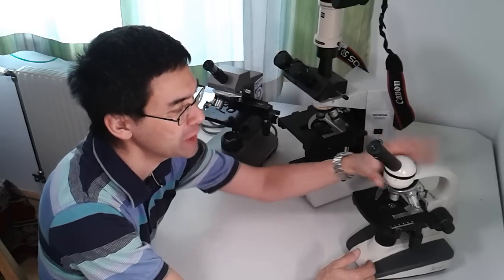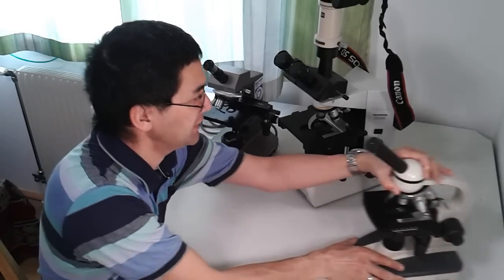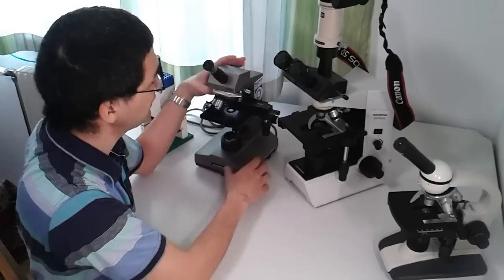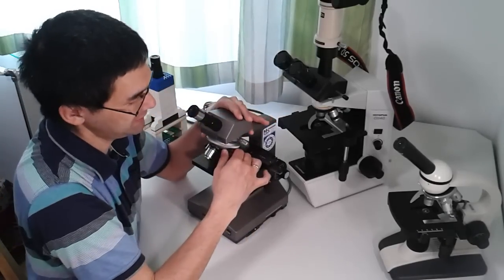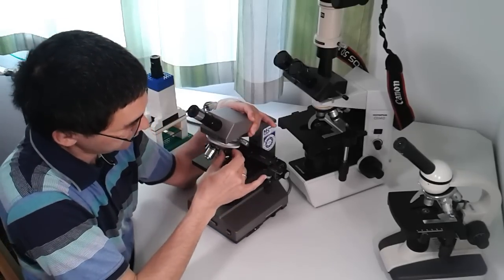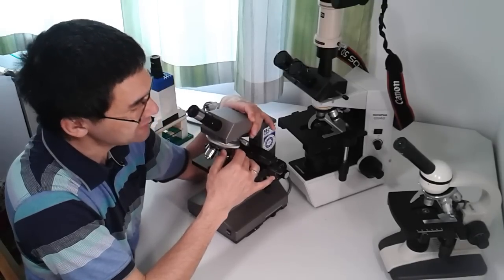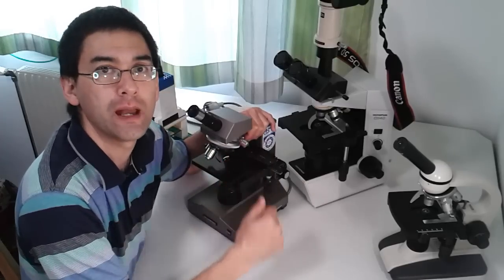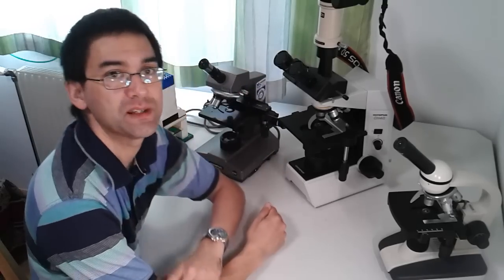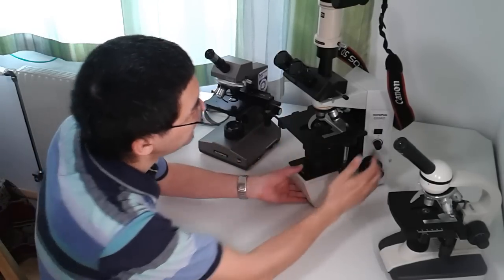All three have similar magnifications: 4x, 10x, 40x, and this educational microscope even has a 100x oil immersion objective. On the large CH40 I removed the oil immersion objective since I don't need it, and on the CH-A there's still space for an extra objective — just remove the cap and attach a new one. Importantly, all objectives are interchangeable because they all use the standardized 160mm DIN system with standardized threading.